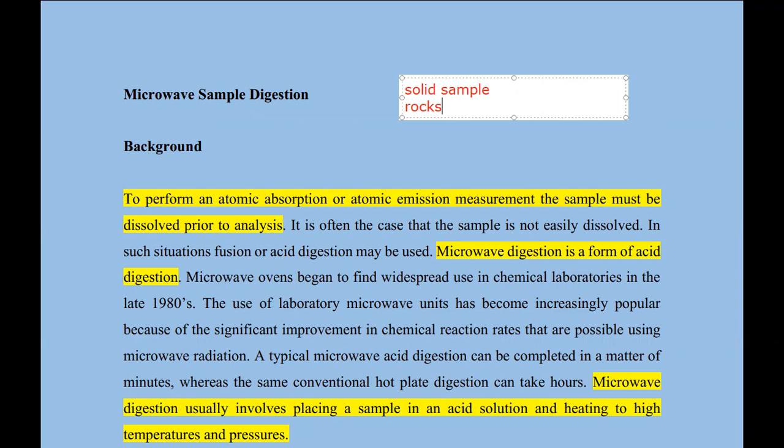Check some of the previous videos that I've done, where we talk about the stages involved in sampling. First of all, you need to have a desktop stage where you look for the methods that will be used in sample collection, more or less just planning.